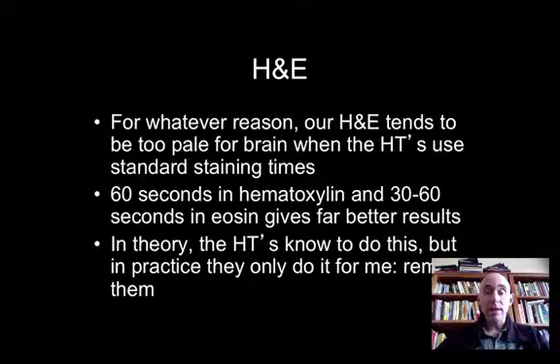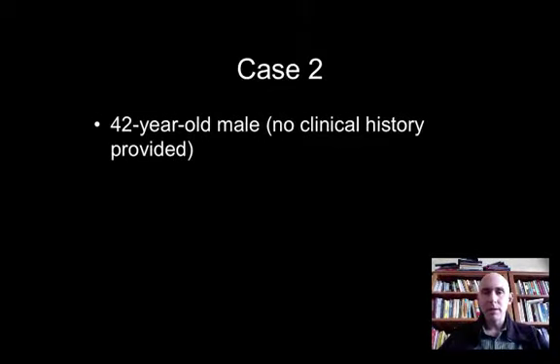In theory, the histotech should know how to do this for all brain and spinal cord cases. In practice, they only do it for me, so be sure to remind them when you're encountering these on your own, or your stains are going to look pale and you're going to struggle to see the cytoplasm.